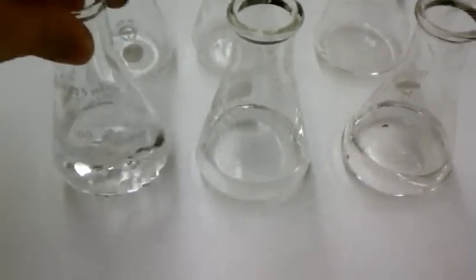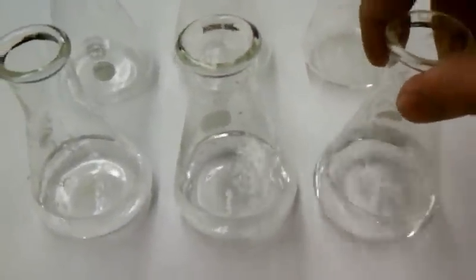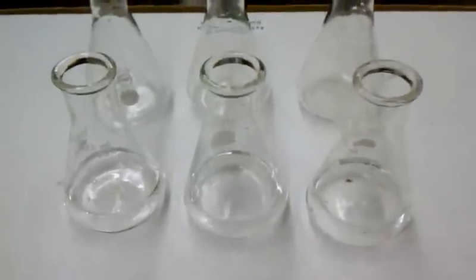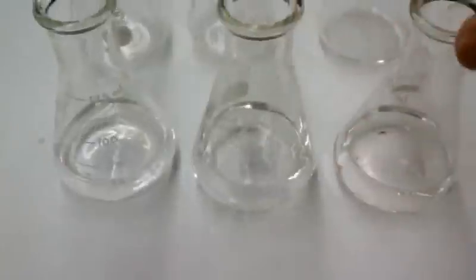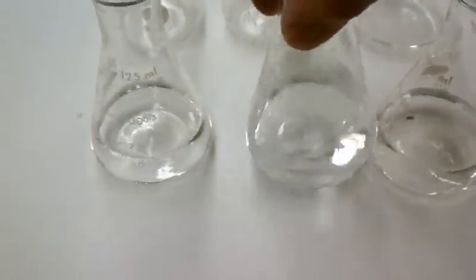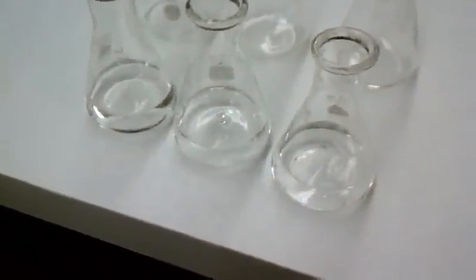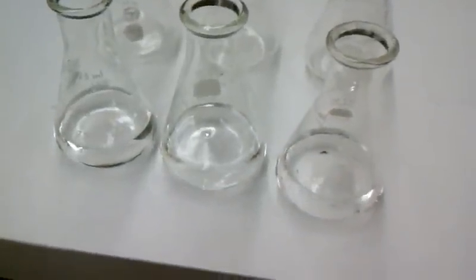What we're looking for is color to appear. Let's see which one comes in first. Now we started them at different times. Wait for it.